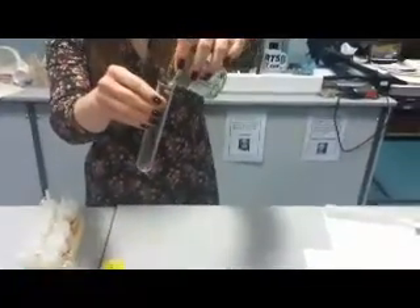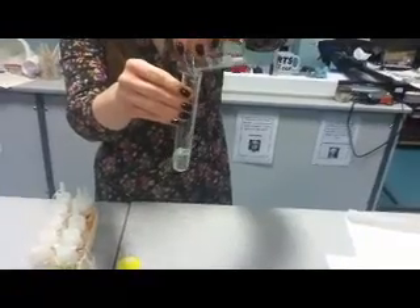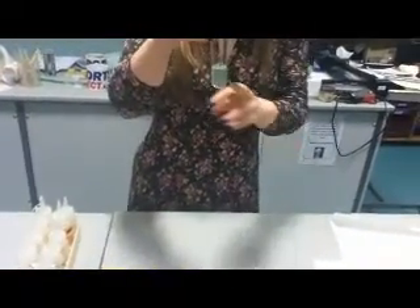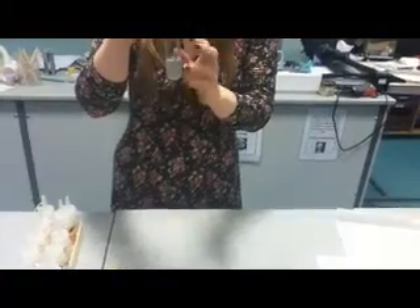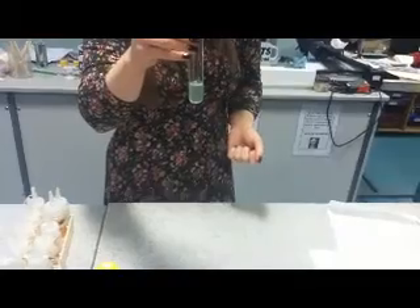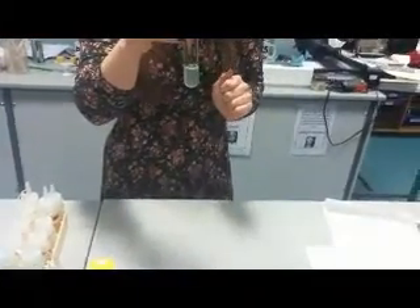I'm going to transfer the filtrate to my boiling tube. If at this point you see you've got any bits of cells from the banana in there, do a second filtration in a separate beaker with a separate piece of paper, because you don't want it to be cloudy with any other bits of cells.